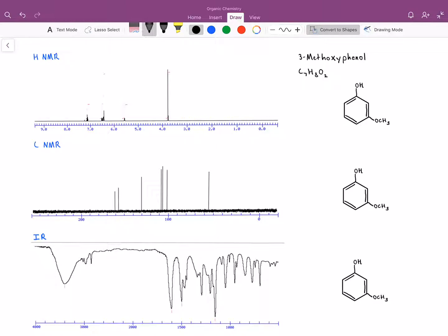We'll be talking about the individual parts of this compound. I would encourage you to pause the video before I start going through it and give yourself an opportunity to see if you can identify which hydrogens or which carbons are making the peaks that we are seeing on the HNMR and CNMR, and as well for the IR. Alright, hopefully you had a chance to work through that. I wanted to start with the HNMR up here at the top, and I'd like to start off by identifying the eight hydrogens within our compound.